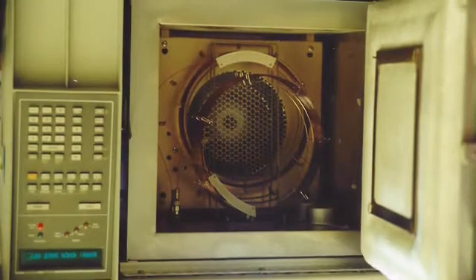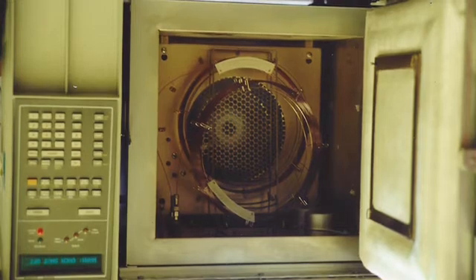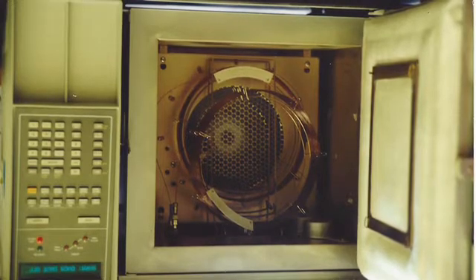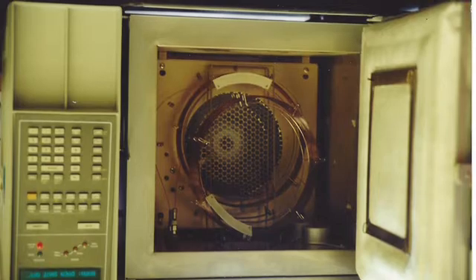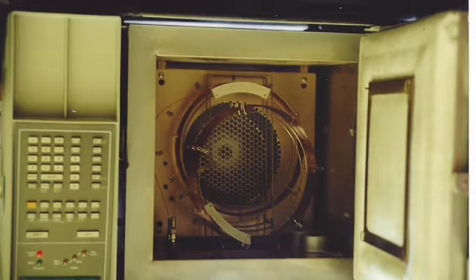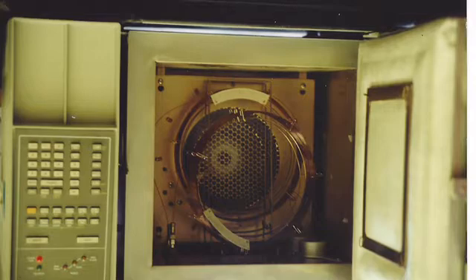So this is a picture inside the oven with the door open. This particular gas chromatograph has two columns. And if you look at the bottom right side of the oven, you'll see the two columns. They're very small, as you can see, and quite long. So that's the oven, and as I said before, we have very tight control of the temperature in the oven.